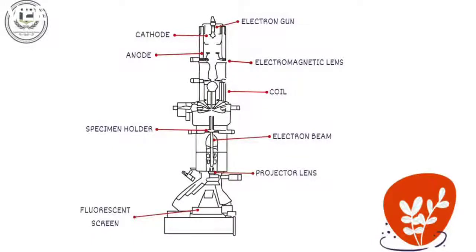For real-time imaging and modifications, TEMs originally employed a fluorescent screen that emitted light when touched by the transmitted electrons, as well as a film camera to record permanent, high-resolution pictures.